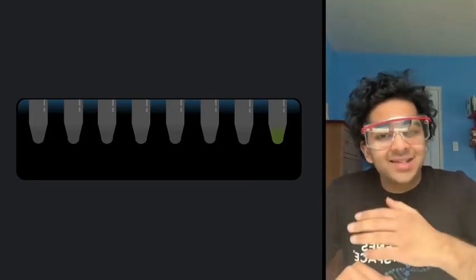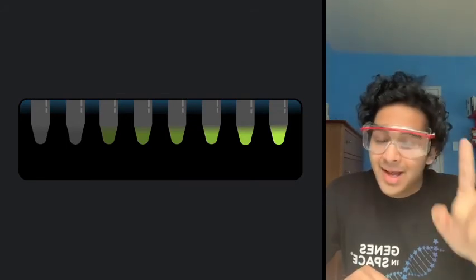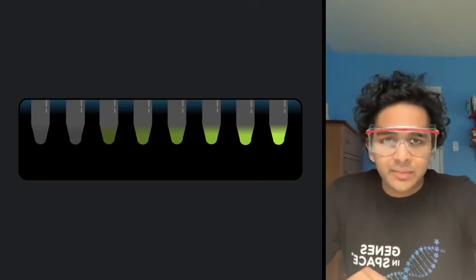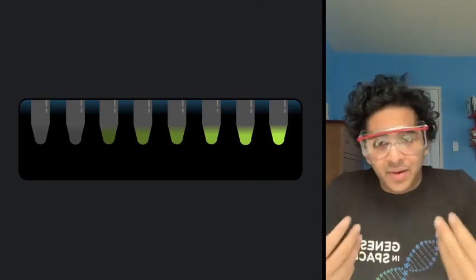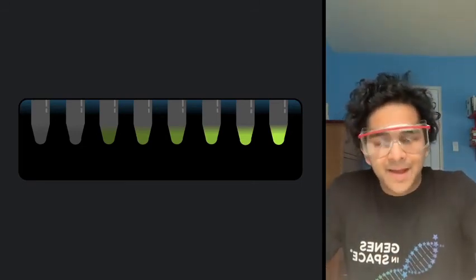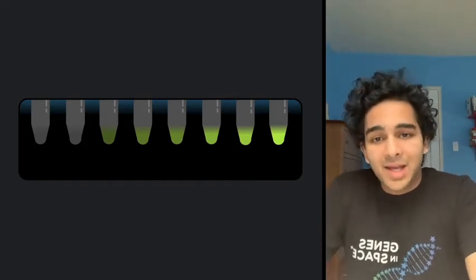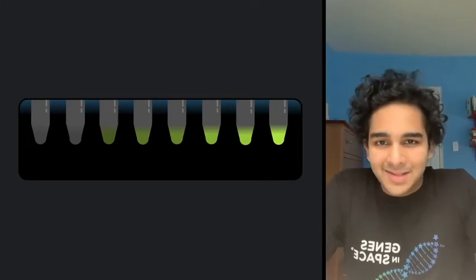And soon, the other treatment tubes are going to light up too, and that's in sequence according to the amount of RNA for gene X they had in them. And remember, that's the result of cells responding differently to the amount of drug in each tube. So also take note of the 2 controls we used, water and no treatment. They're a baseline to which we can compare the fluorescence because they don't shine as brightly as the rest. And so finally, with just a few snapshots, it's starting to look like my hypothesis is being supported. The presence of medication seems to be associated with increasing expression of gene X in space.